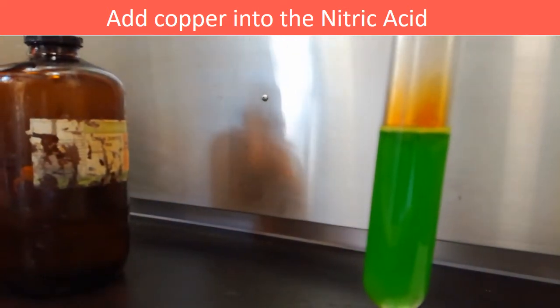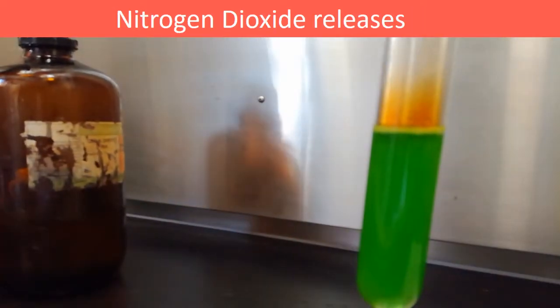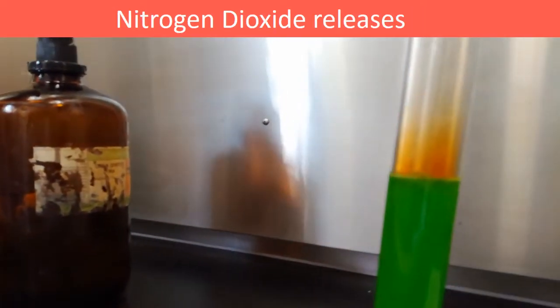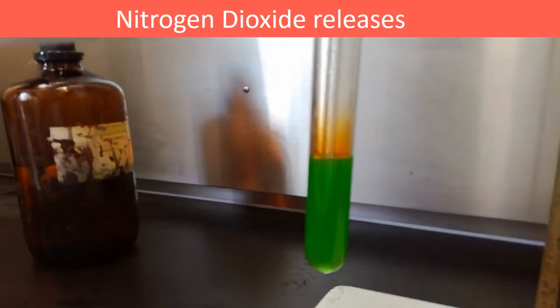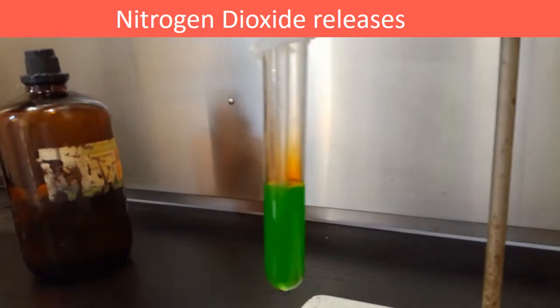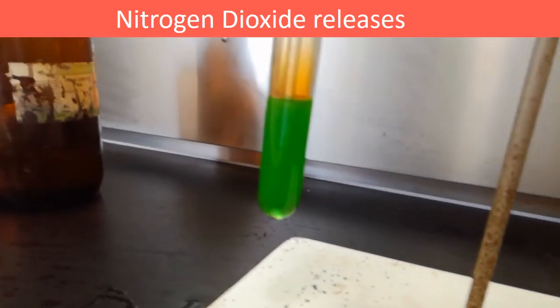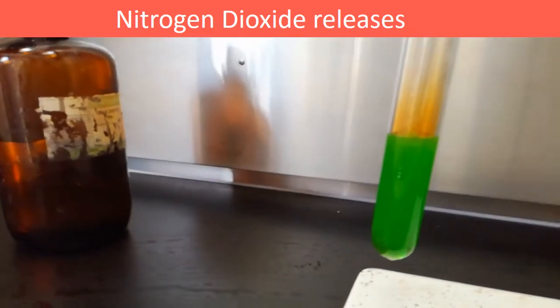Now, we can see the brown color nitrogen dioxide gas is formed inside the test tube. If you observe well, you will be able to see the gas is slowly moving in the upper direction inside the test tube.